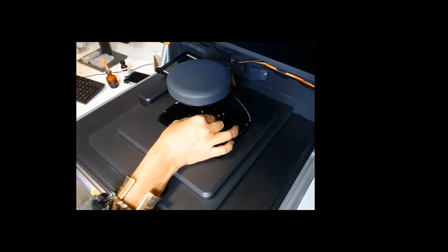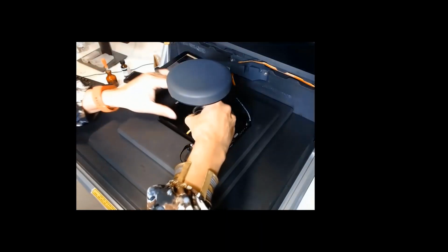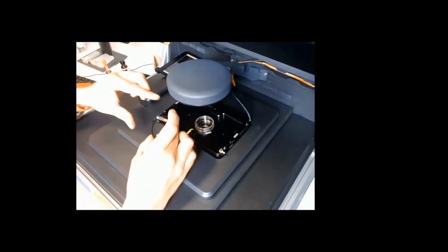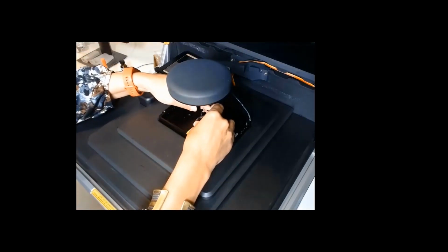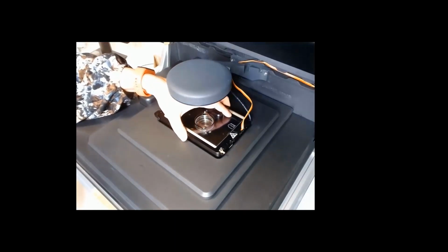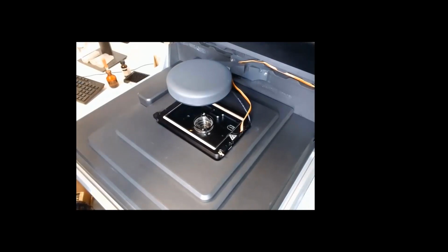Take off the dish fixer, and you add your multi-well dish. You can then use this fixer to fix your dish. Now the sample is fixed. We cover the lid to keep the temperature on, and using the joystick I will move to center my cross where I want it to image. I close the lid of the system and I go to the image acquisition.